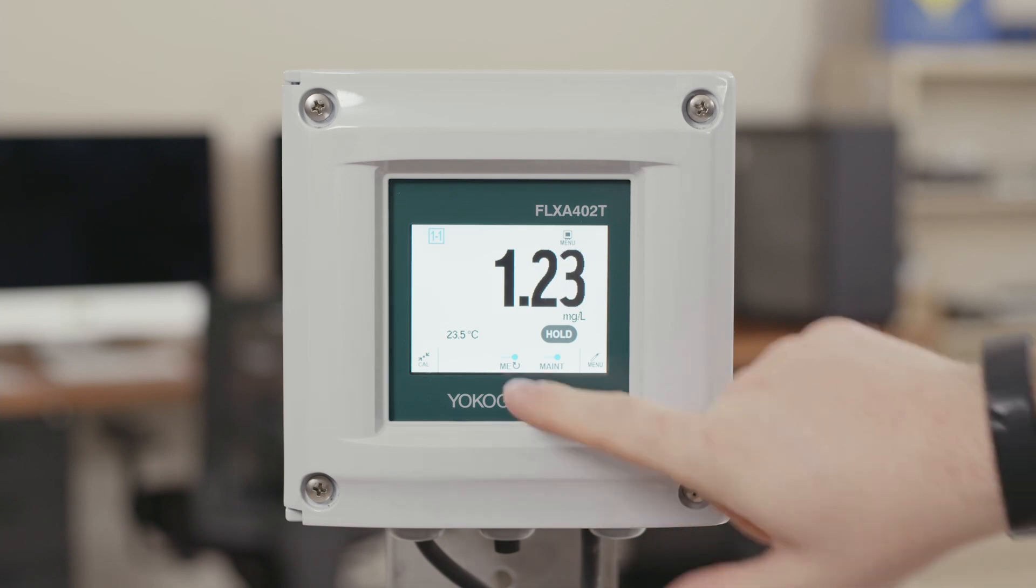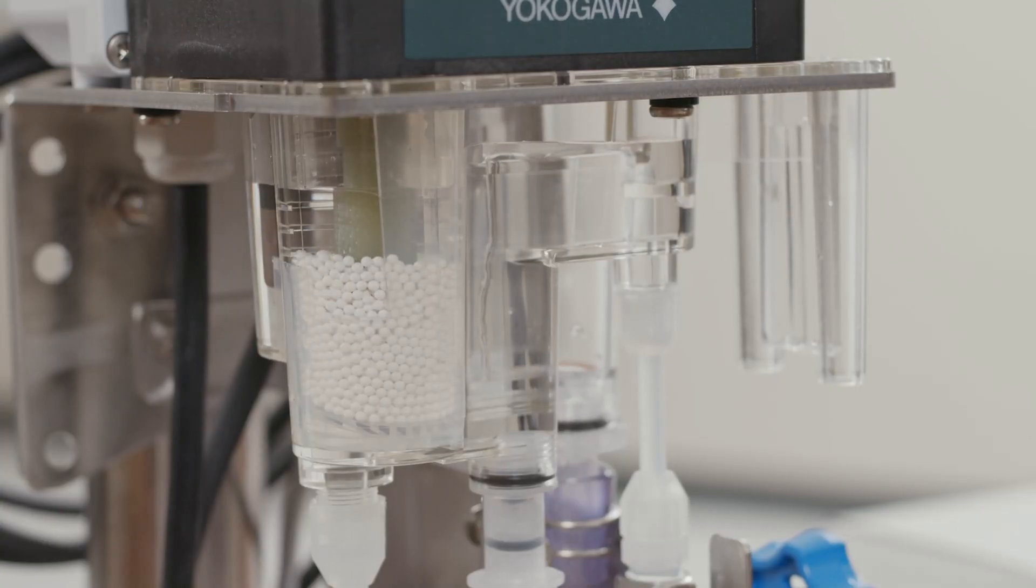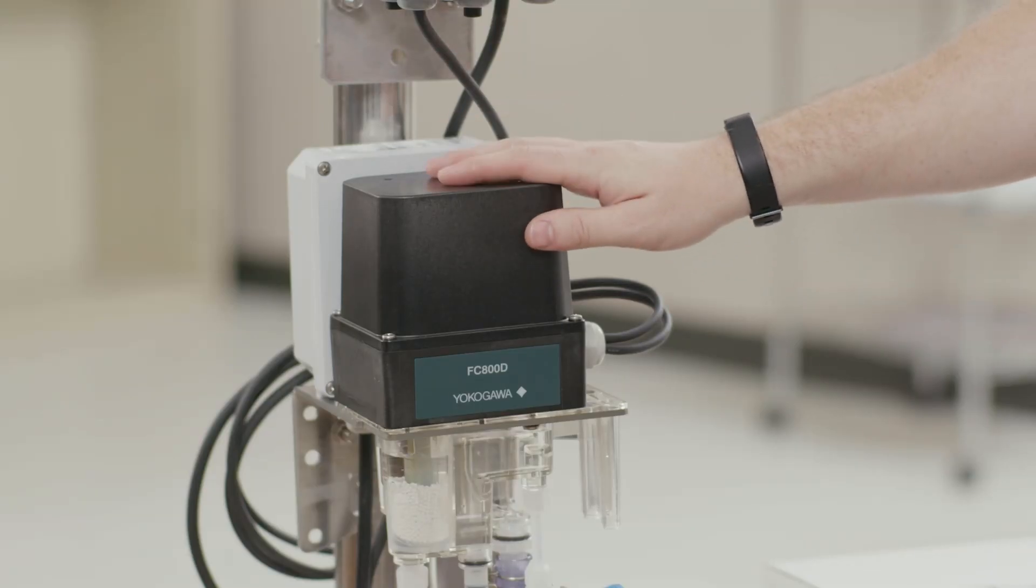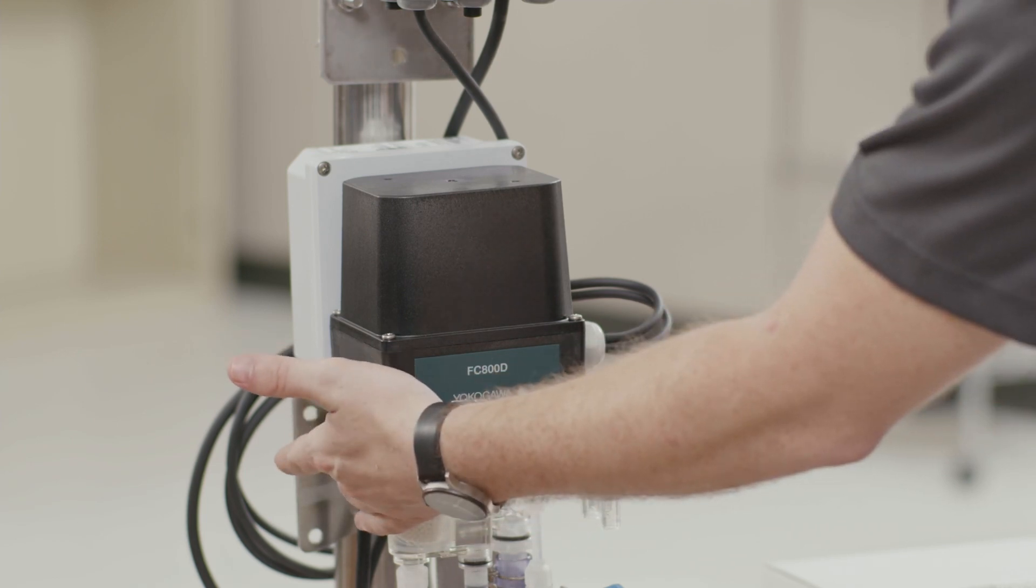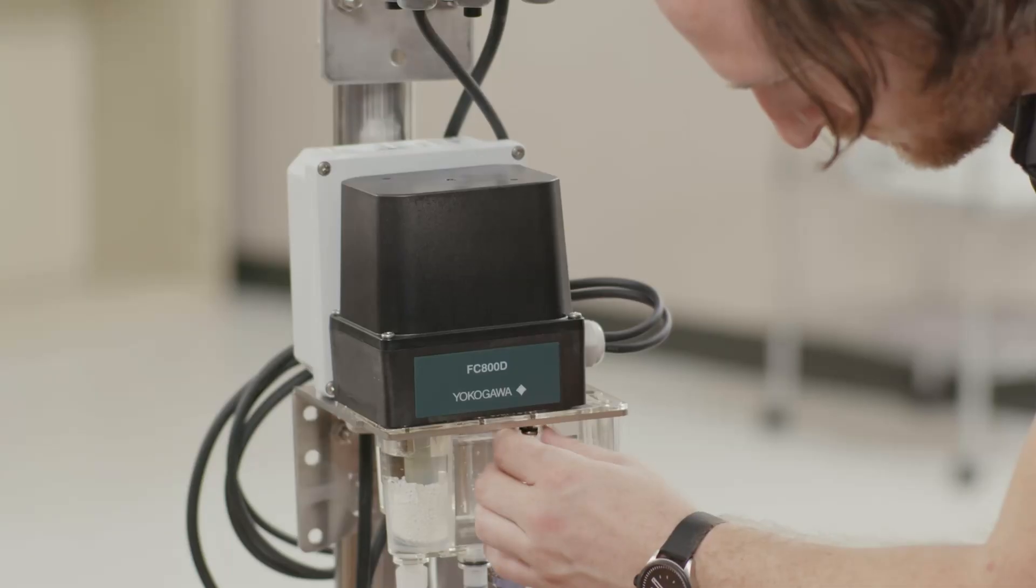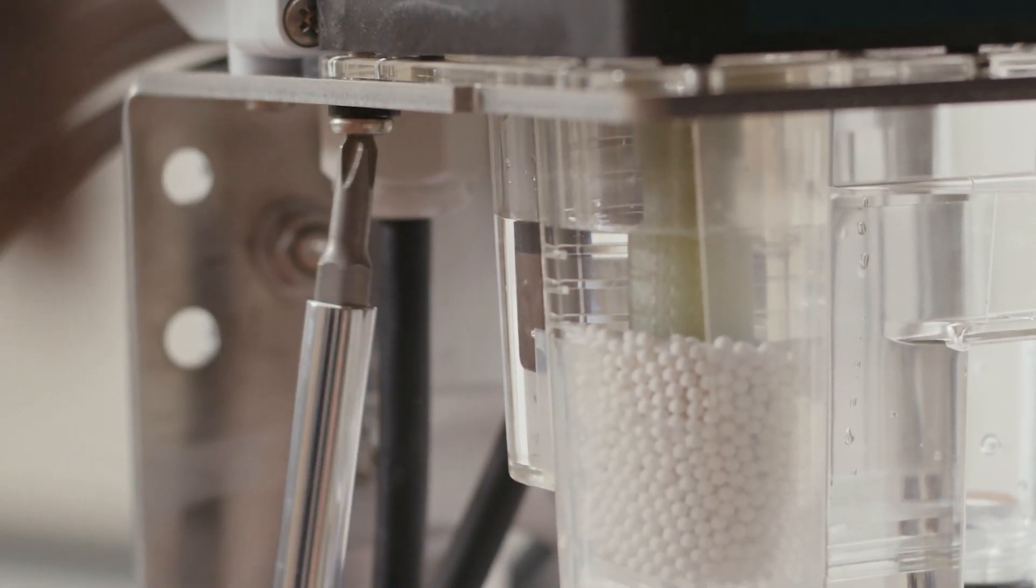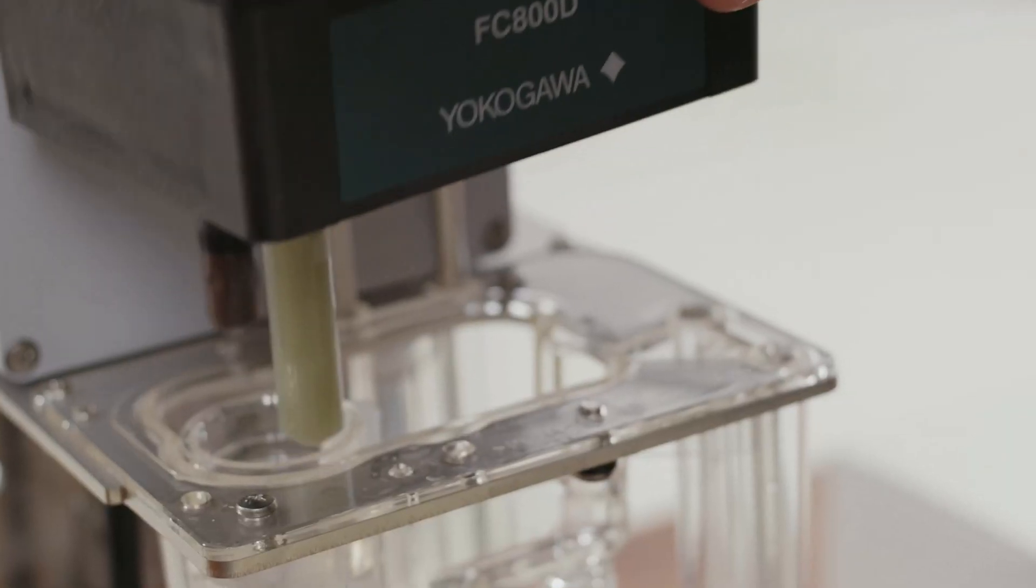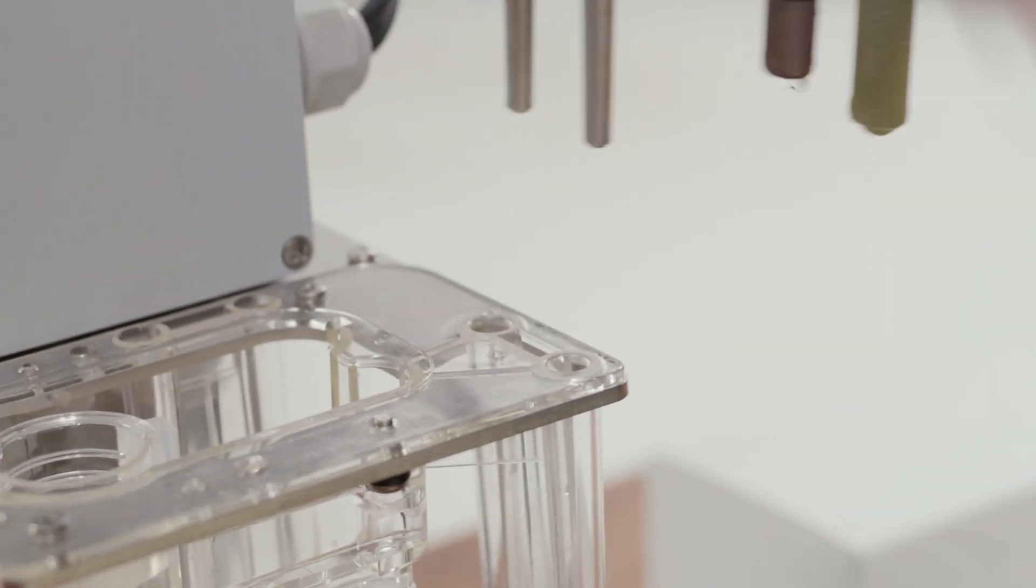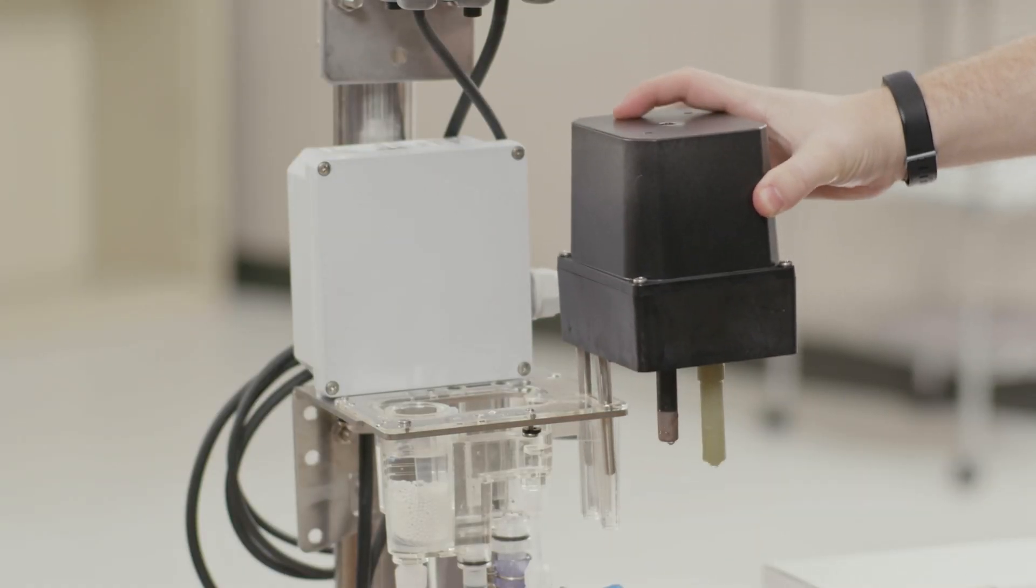We're going to turn off the measurement electrode rotation. Next thing we want to do is remove the electrode from the flow cell. You can do this by undoing the two screws on the underside of the flow cell. These are capped screws so they'll stay with the flow cell. You can lift the electrode assembly off and put it into maintenance position, which is where these two slots to the right of the flow cell are and align with the two pins on the measurement assembly.